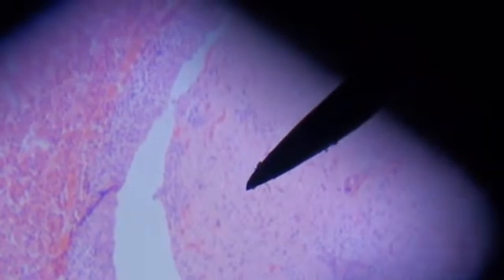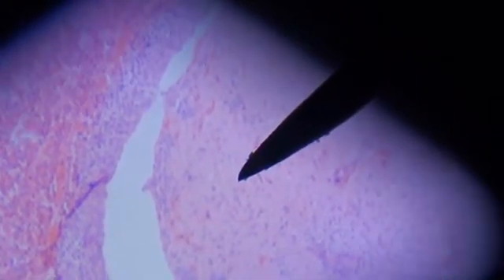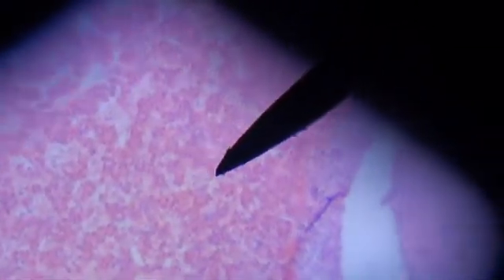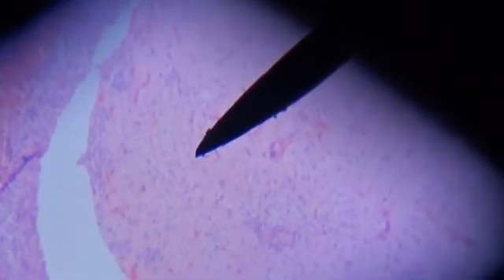Right here we have the pituitary gland or hypophysis. You can tell the difference in color. This area where the arrow is pointing is the posterior portion of the hypophysis.